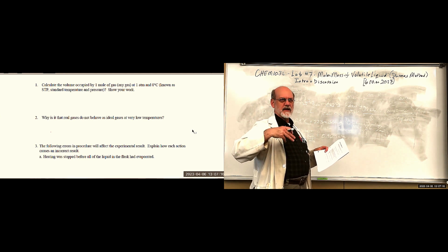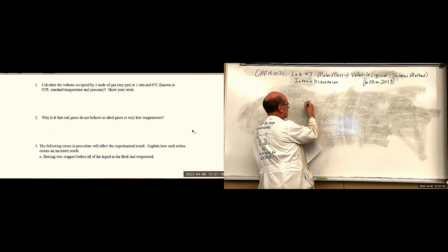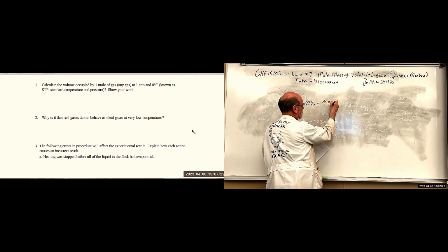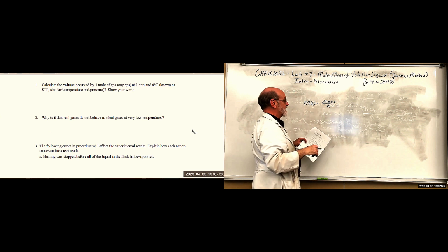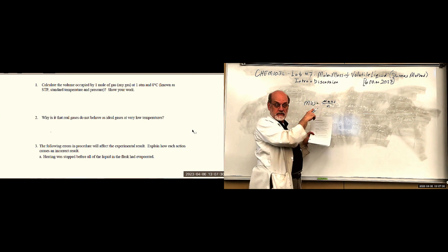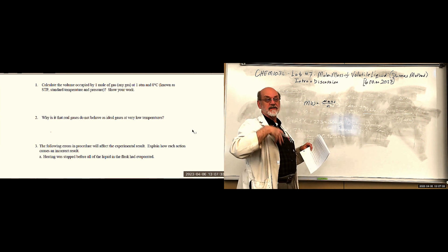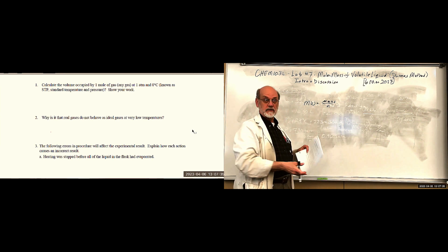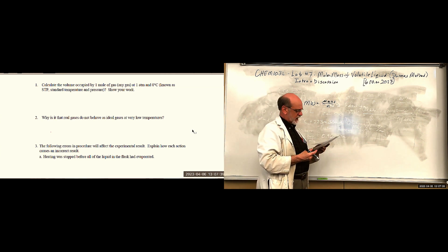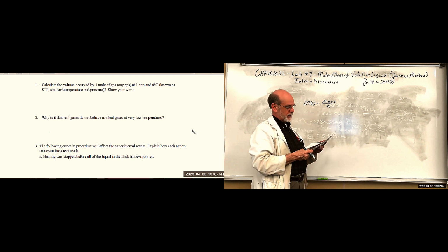So a higher mass divided by moles. Higher mass would bias it in the positive direction. You would have an erroneously high value for molecular weight. What if water remained on the outside of the flask and on the foil when the final mass was determined?